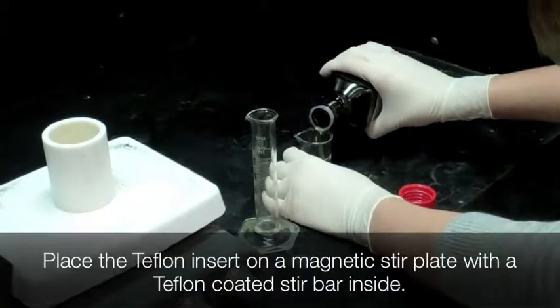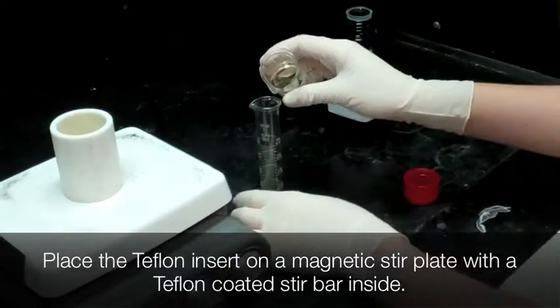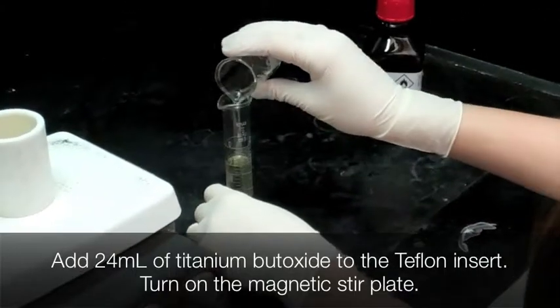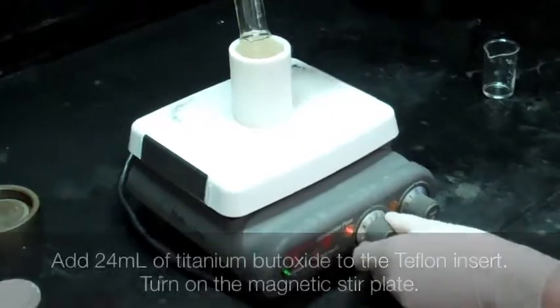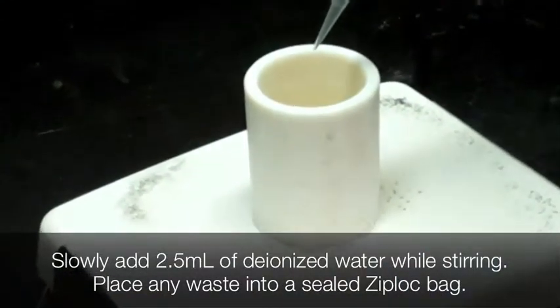Let the bottle of titanium butoxide sit in ice for 15 minutes. While this is sitting, place a Teflon insert on a magnetic stir plate and put a Teflon stir bar in the insert. Once 15 minutes is up, add 24 milliliters of titanium butoxide to the Teflon insert. Slowly add 2.5 milliliters of deionized water drop-wise.